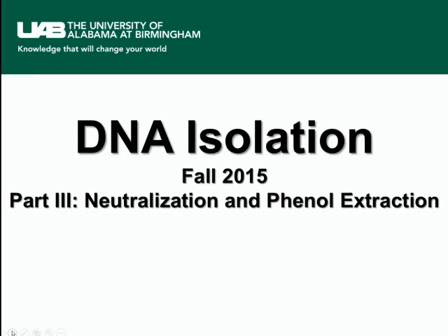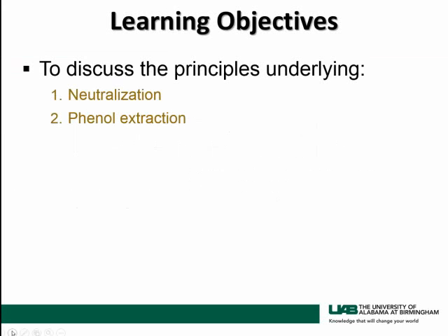Again, we continue our lecture on DNA isolation, and we come to part 3. In this section, we're going to deal with neutralization and phenol extraction. The learning objectives for this section are to discuss the principles that underlie the process of neutralization and the process of phenol extraction.